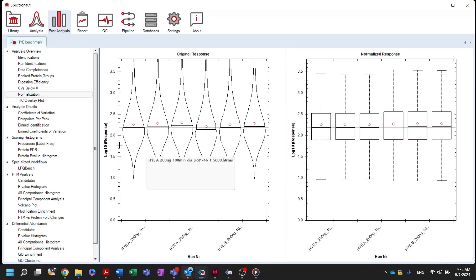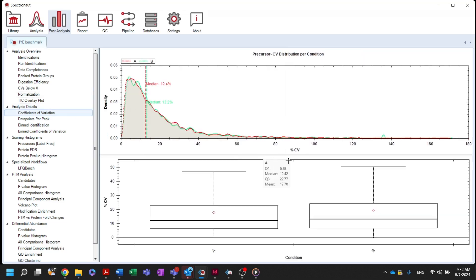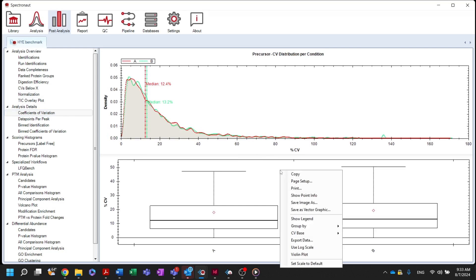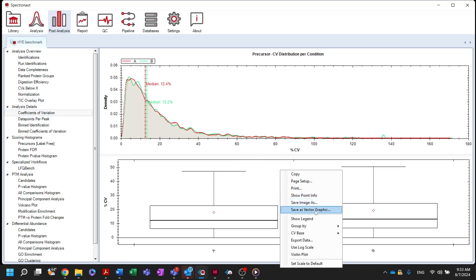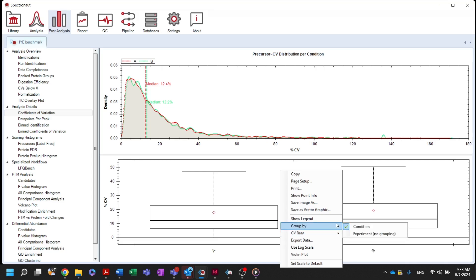The coefficients of variation plot shows the distribution of CV values for each of the experimental conditions. By right-clicking on the plot, the CV base can be changed from precursor to peptide, protein, or protein group. Also, you can select to show data per sample or across the whole experiment.